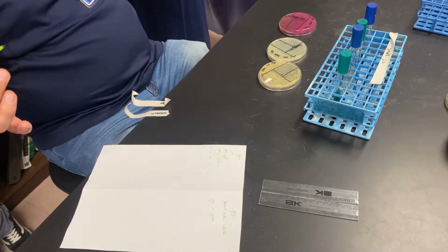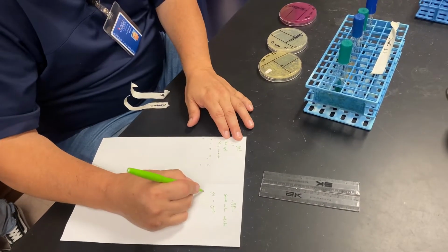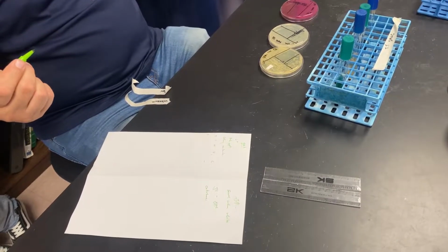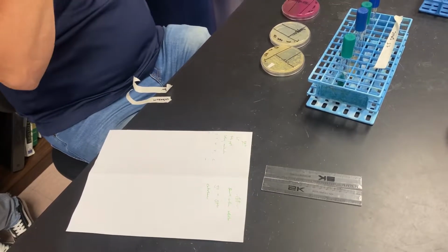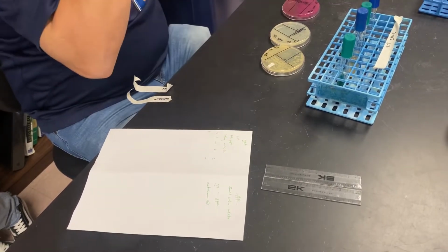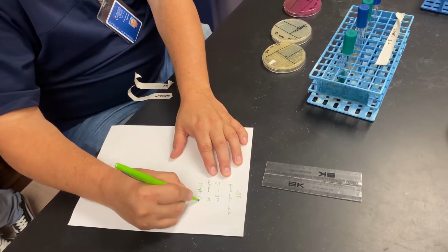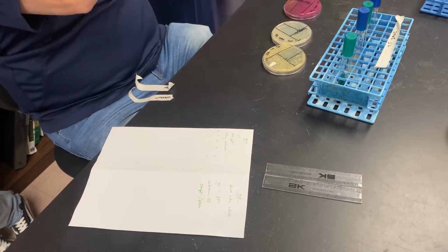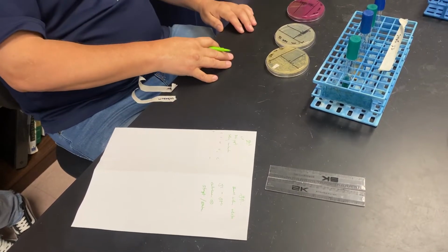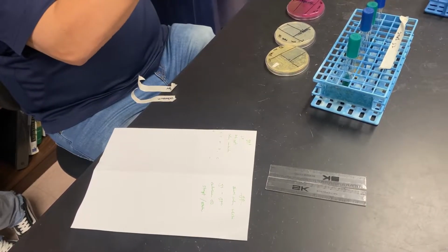Gram-positive coccus. What's the next thing you do? Oh, catalase. Always catalase. So if it's a gram-positive coccus, it's catalase. Now, I'm just going to say my catalase was negative. I'm just making this up, right? I don't know that this is correct. If it's catalase negative, it's a strep or an enterococcus. So now I'm going to go to that one sheet that says streptococci, and that's what I'm going to use to work up from then on. Then I would make decisions based on what I see, what I would do next.